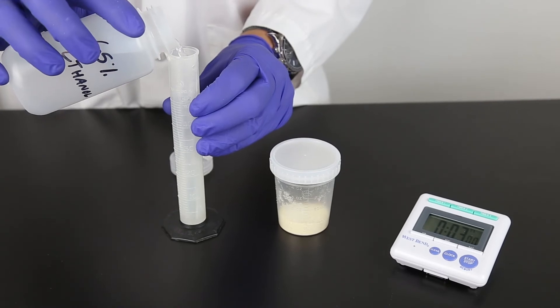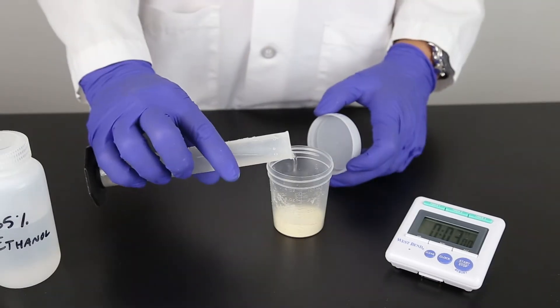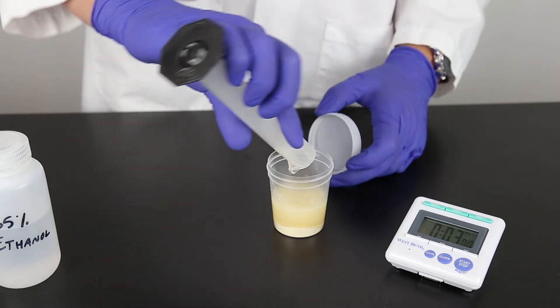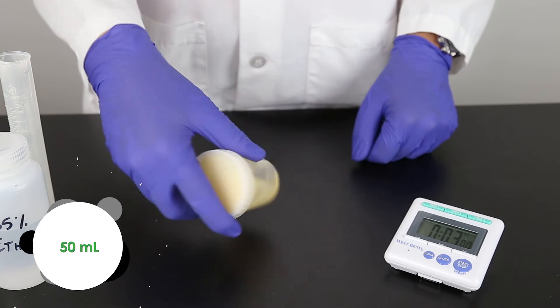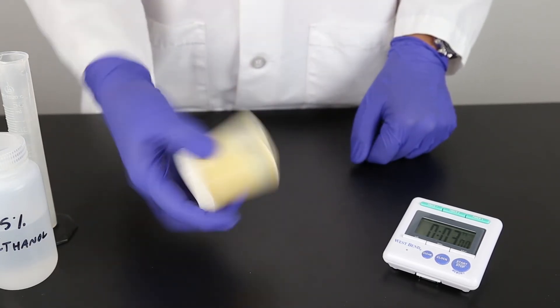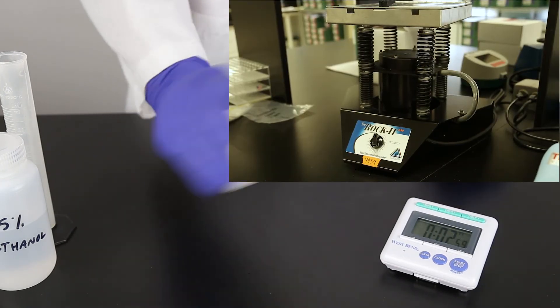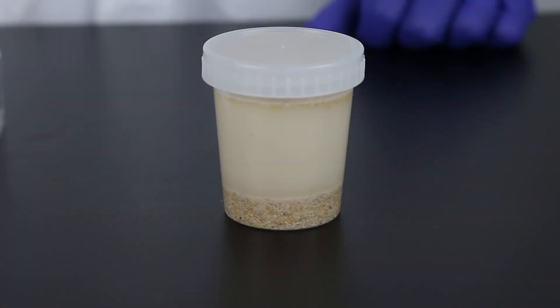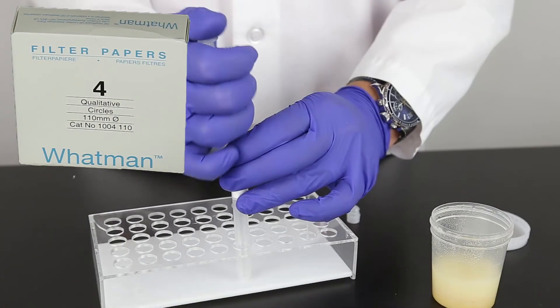The sample is extracted with a ratio of 1 part sample to 5 parts 65% ethanol. For this example, we're using 10 grams of ground sample with 50 milliliters of 65% ethanol. Vigorously shake for 3 minutes using hand or mechanical means. Allow sample to settle and filter with a filter syringe or Wattman number 4 filter paper.